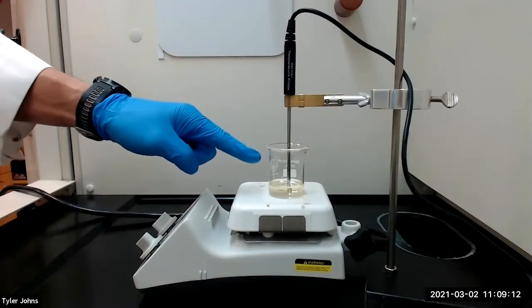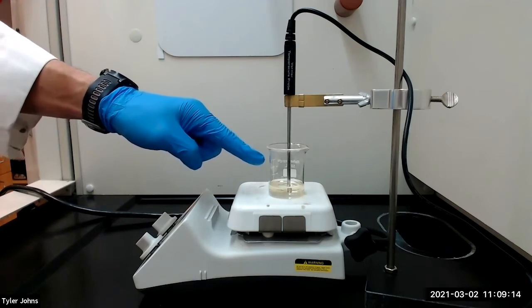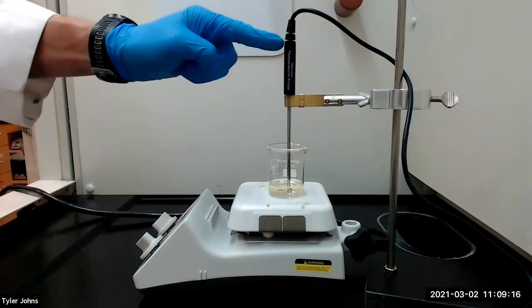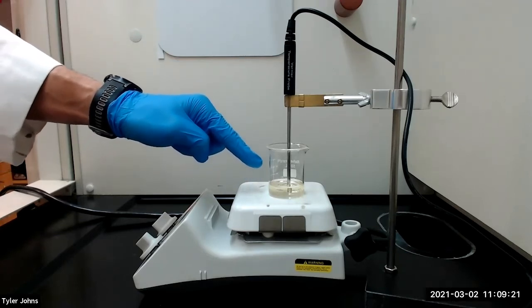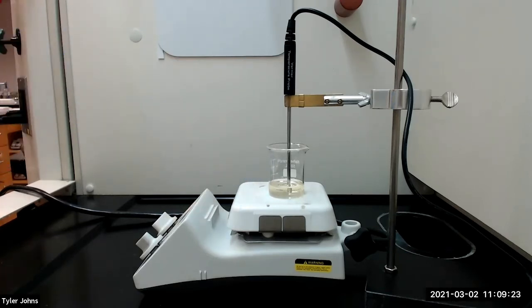We will next place the 50 milliliter beaker with our biodiesel on a hot plate and insert a thermometer into the biodiesel. We will heat the biodiesel to about 70 degrees Celsius for 15 to 20 minutes to remove all of the methanol.